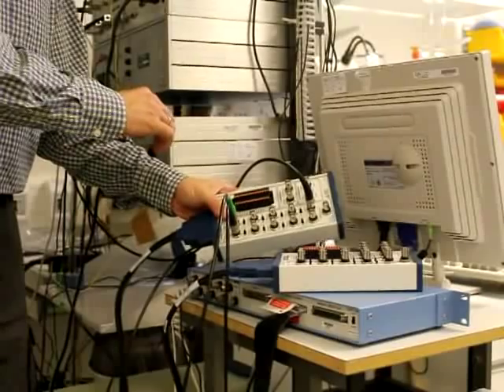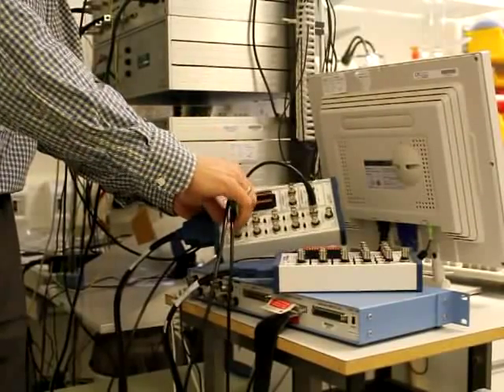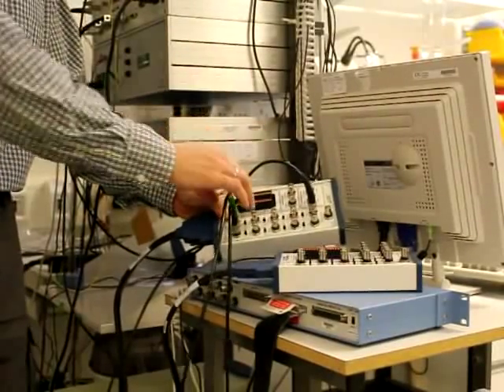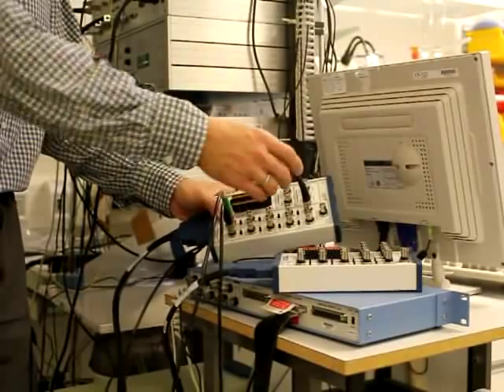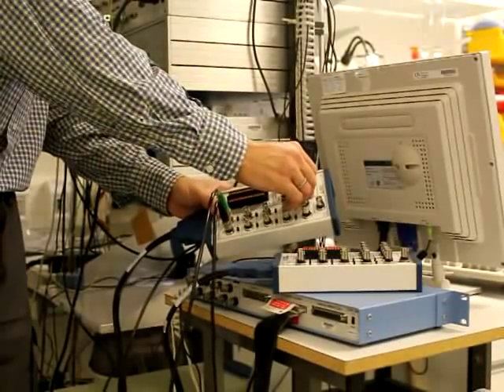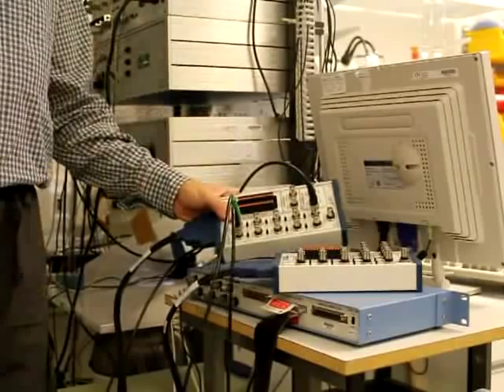So you see here, that's the inputs coming in, inputs in terms of the dynamic clamp, voltage from the cell. And here is the output, that's the current command that will go back into the cell.